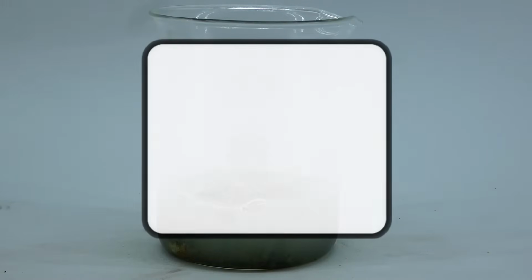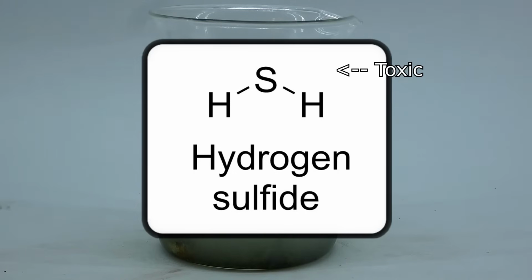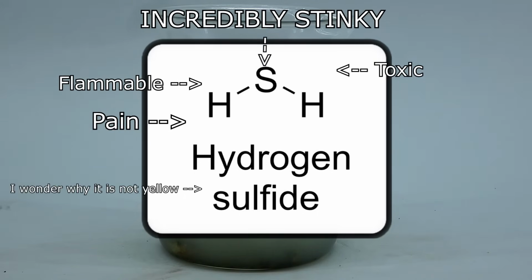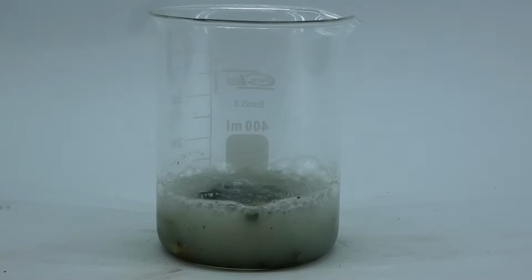That's right, this reaction produces an incredibly toxic, flammable, and worst of all, incredibly stinky gas that is just a pain to deal with. The reason why I added the sulfur was not to die of stink, but to make the silicon easier to remove from the aluminum oxide.